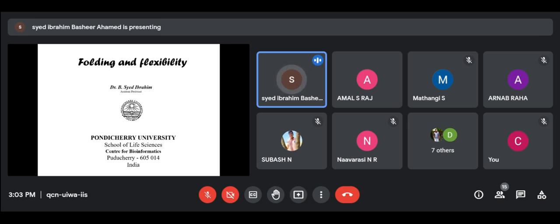Okay. So anyway, in that case, your practical class will deal with wet lab work. Regarding the UV spectrophotometer, CD spectrophotometer, crystallization, purification, and DNA melting point, all these things you have to carry out in a wet lab. Only a few things we can do online, like the torsion angle calculation.